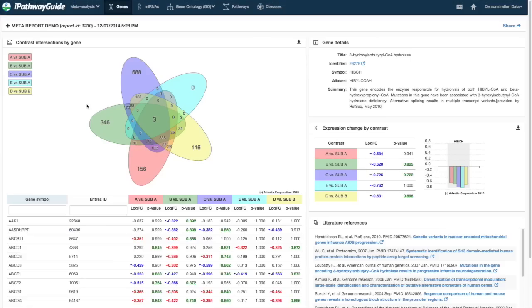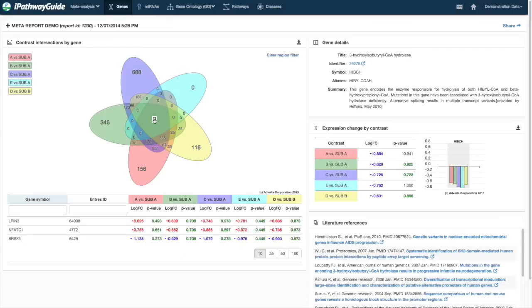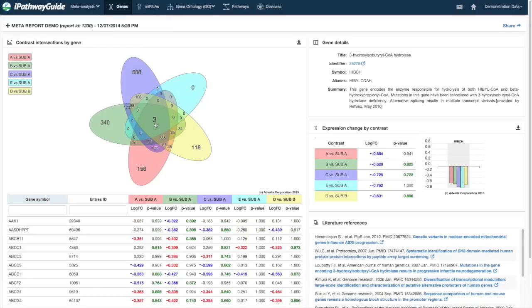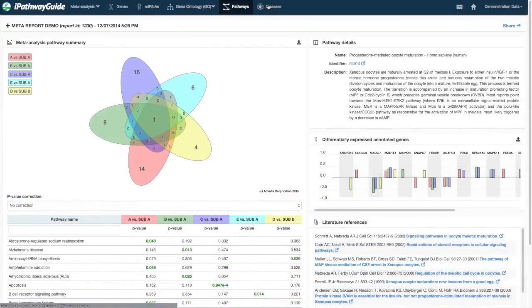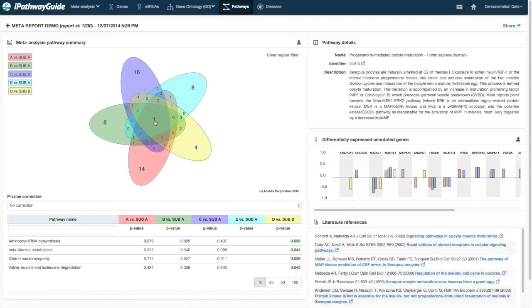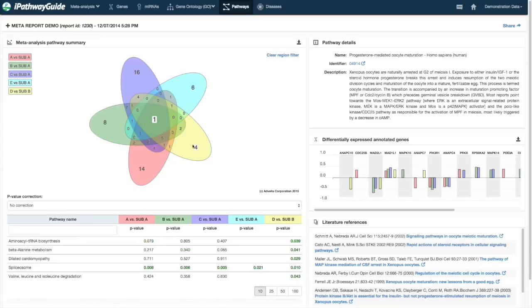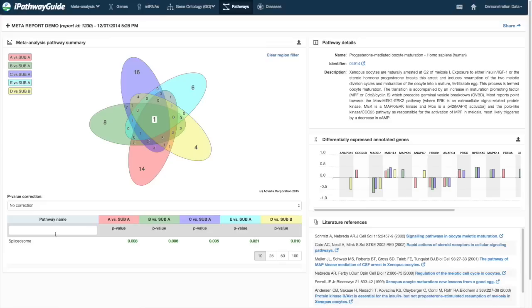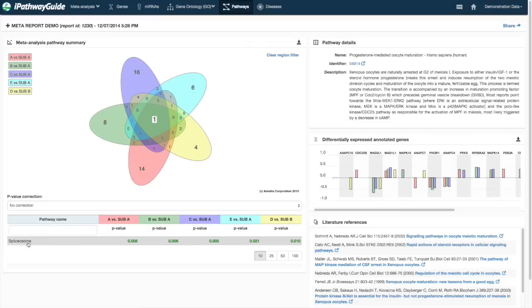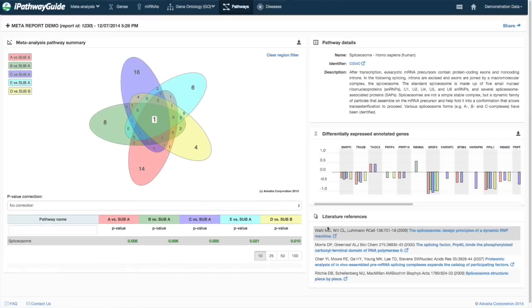iPathwayGuide also provides the ability to look at multiple experiments at once in a meta-analysis, allowing you to quickly identify common or unique features in your data or compare to a previous experiment. iPathwayGuide's intuitive interface allows for easy navigation, identification of relevant references, and downloading of images and tables for publications.